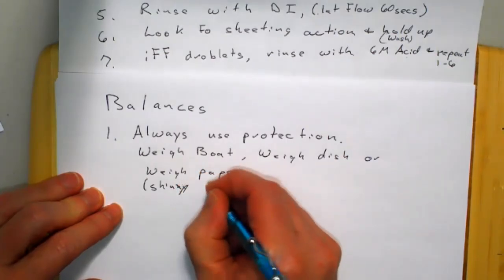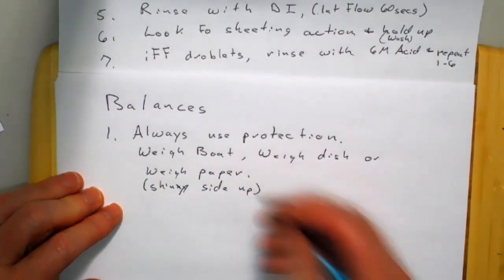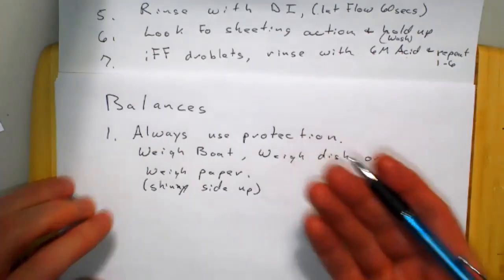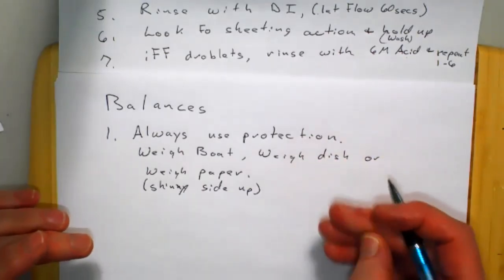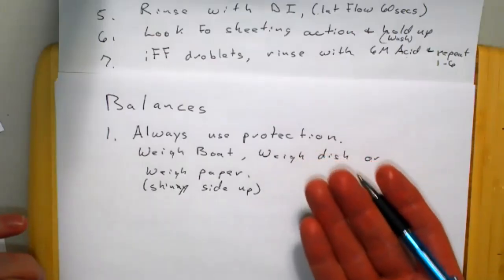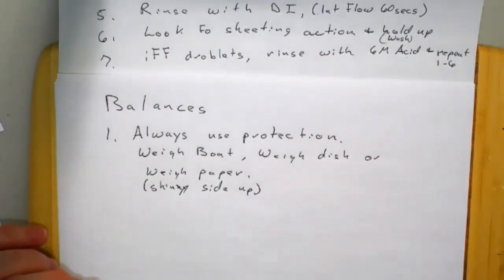Shiny side up. Just like if you got to drive home today, try to keep your car like weigh paper. Okay, so weigh paper, I don't have a piece to show you, and it's hard to see, but you can feel it. One side's shiny and one side's fuzzy on purpose. So the fuzz on the bottom is to neutralize static charge.